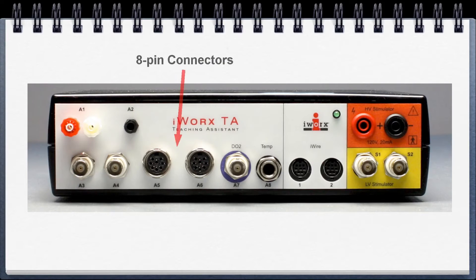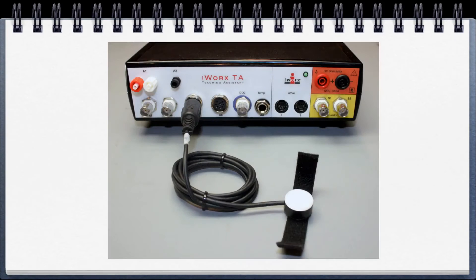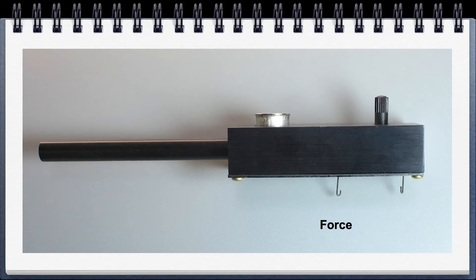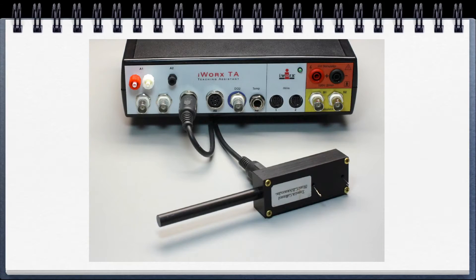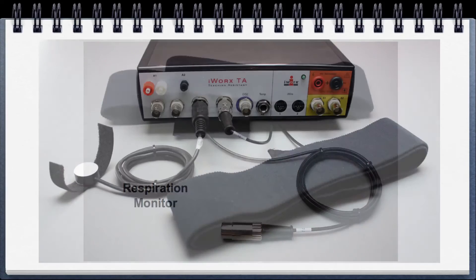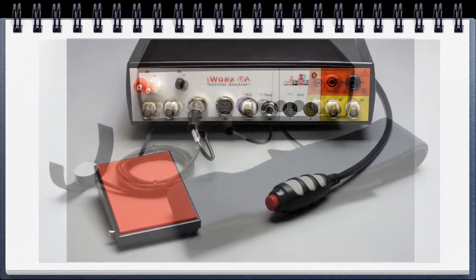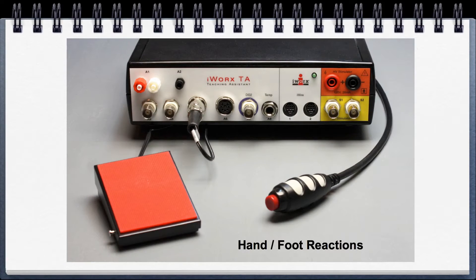The 8-pin connectors have a number of uses. We have the pulse wave sensor that plugs in like so. For the animal kit, the force sensor, which plugs in like so. In the psychological kit, the respiration monitor, and also the foot reaction switch in the psychological kit as well.